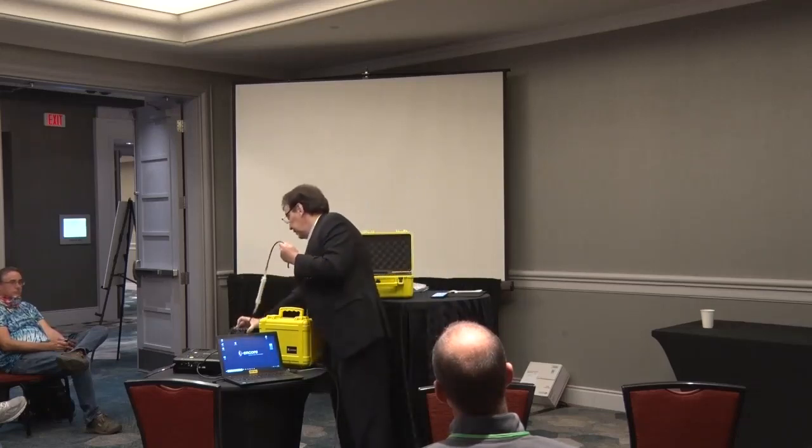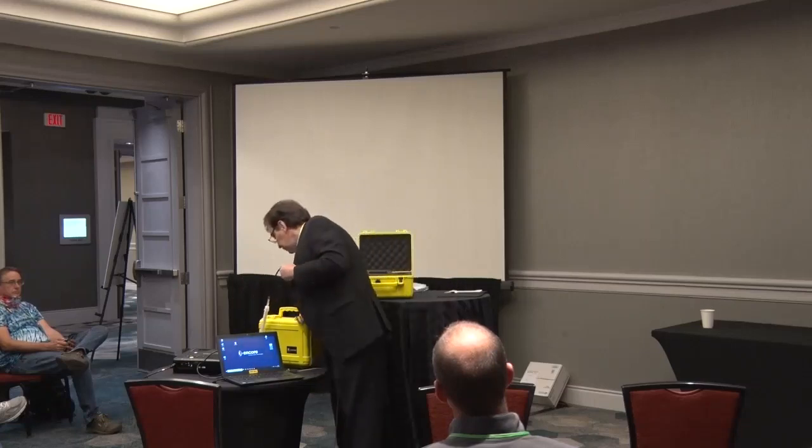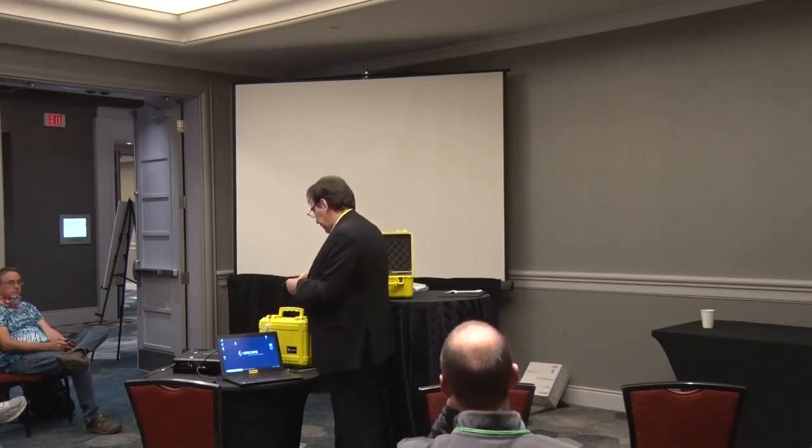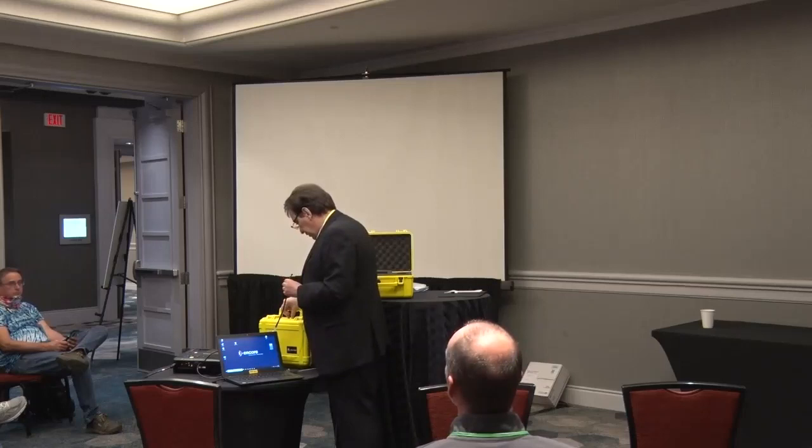So I'm going to take this out. Got some radon in here, and you'll just have to trust me, I guess, to read the numbers. So the sniff level right now shows 0. And you can hear the beeps like once every minute or so.